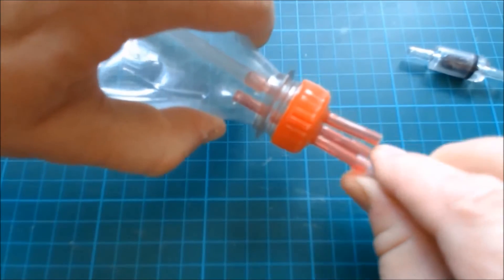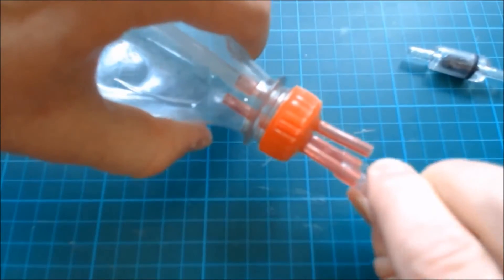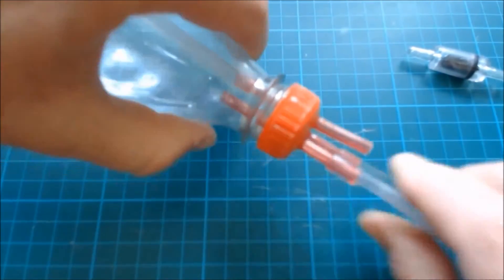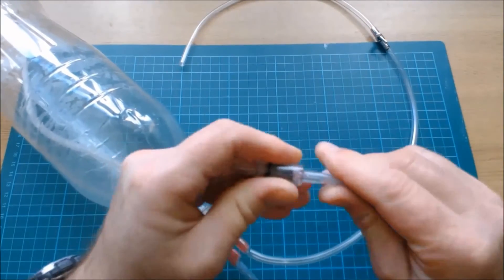Cut a forty centimeter or sixteen inch length of tubing and connect it to the second long straw. The other end of the tube is connected to the non-return check valve.